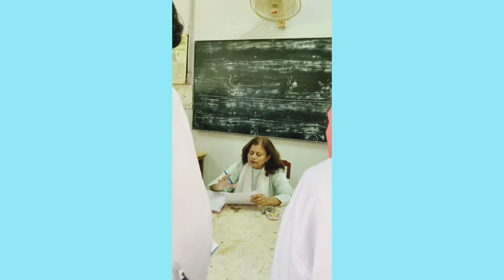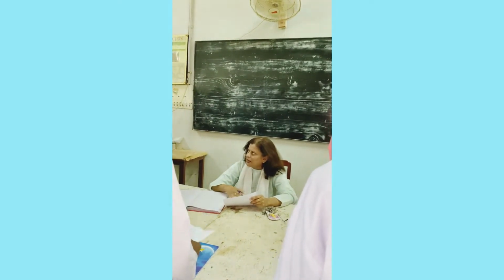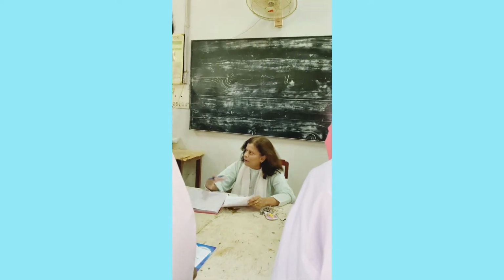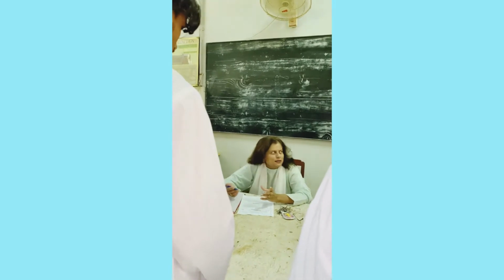Now, every experiment, every organic compound needs to be prepared from its crude state. What is a crude state? Do you know what a crude compound is? Can anyone tell me what a crude compound is? Impure state, yeah. And when you recrystallize it, you will say that it's a recrystallized compound. It's no more in the crude form.